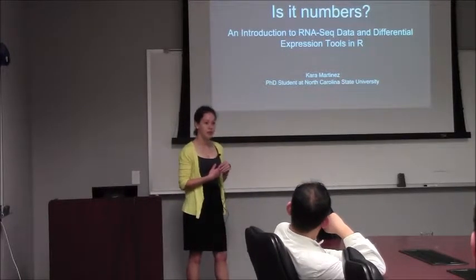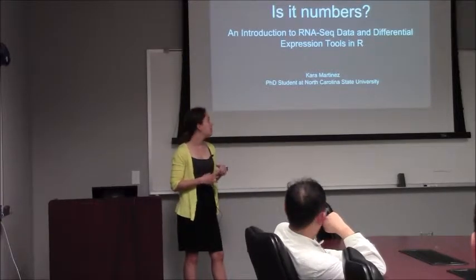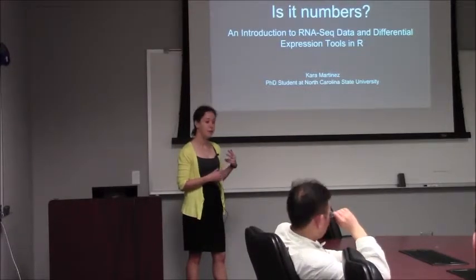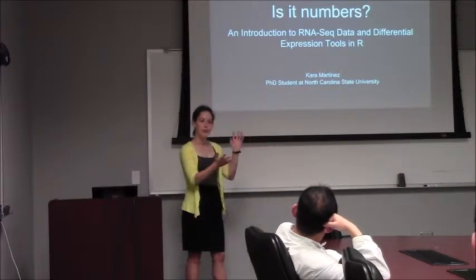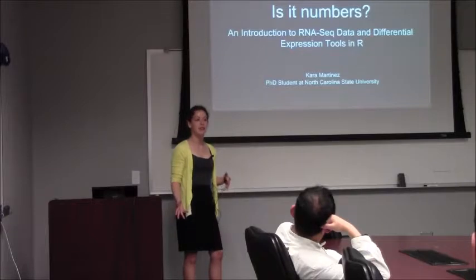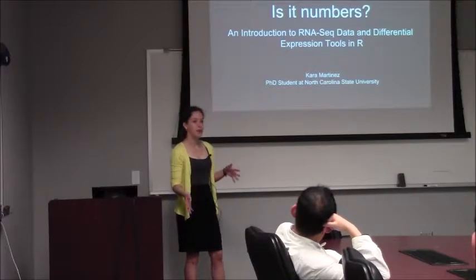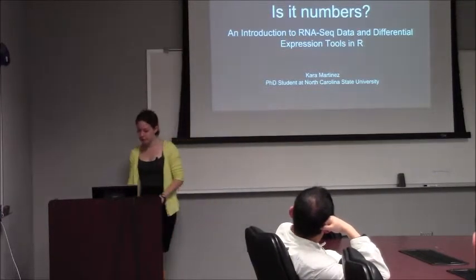So in this talk, I'm going to talk about what RNA-seq data is and what kind of questions you can answer with it. In addition to that, I'm going to talk about how to take the biological data and turn it into some sort of numbers that we are more familiar with to do statistical analyses. And then I'll go through a quick example of how to do an analysis of that quantitative data. I have a short example.